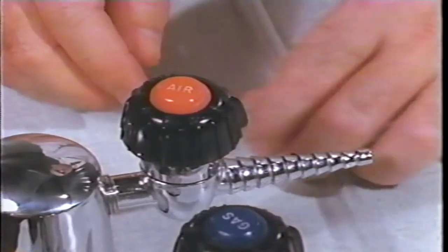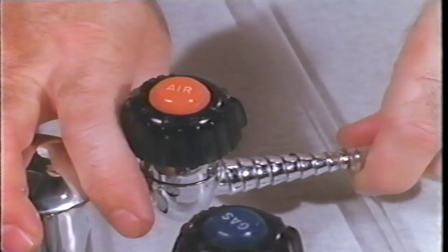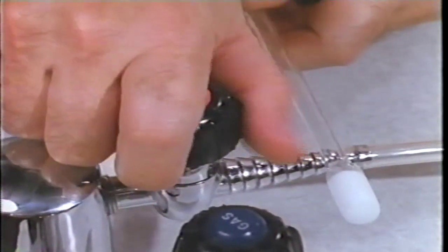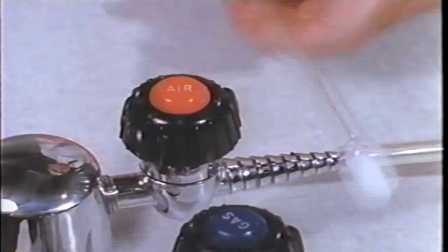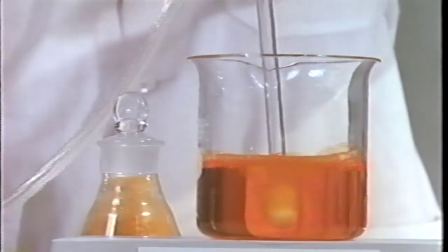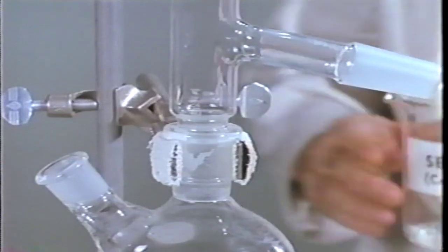A source of compressed air is connected to a dispersion tube. The air bubbles do sweep the volatile bromine out of solution. However, to concentrate the bromine from this dilute gaseous mixture, we'll need more controlled conditions.